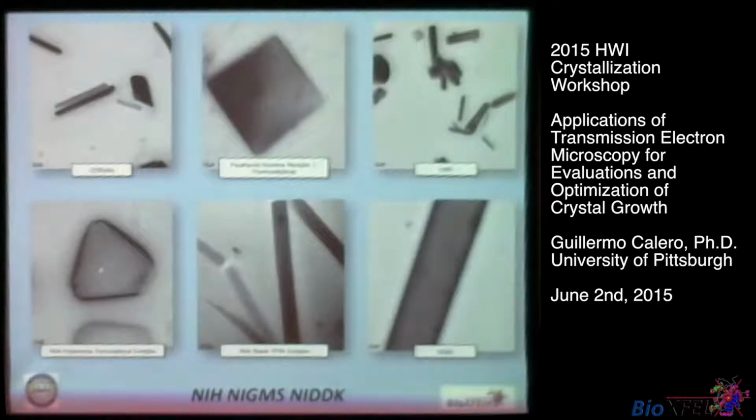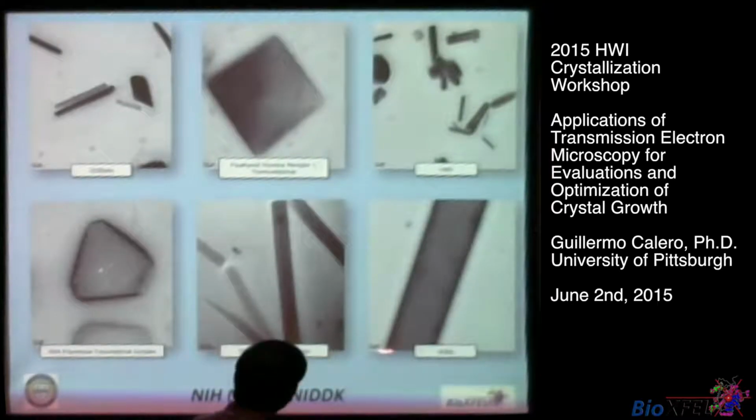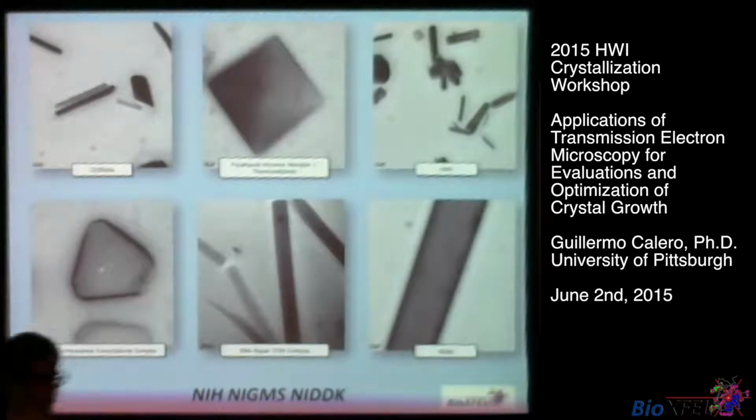For the samples we were trying to look at, we saw these nanocrystals. You probably cannot see this for sure, but this is 0.2 microns, again 0.2. These are a little bit larger. This is 0.2, 0.5. So you can see there are all kinds of sizes.